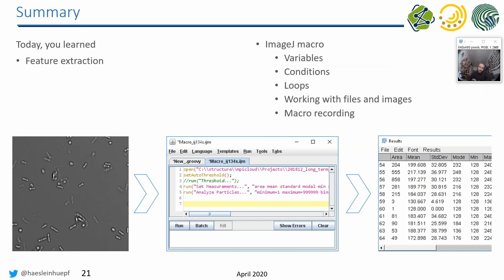Let's shape descriptors. We later want to use shape descriptors in this particular dataset, but we don't want to do it all by clicking again and again for every frame of this video. And that's why I'm going to teach you ImageJ Macro next, so that we can do the measurements of the shapes in this video for every time point, for every frame automatically.